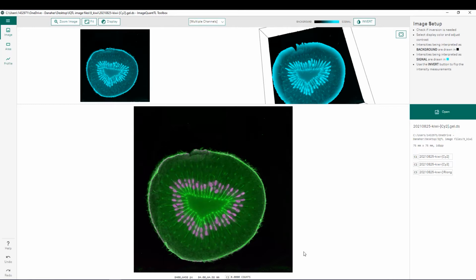We also have our main image where we can view the multiple channels that are overlaid, displayed with different colors, as well as a data summary along the right side, which allows us to see some basic image parameters such as dimensions, bit depth, and also the available channels that we have within the image that was imported.